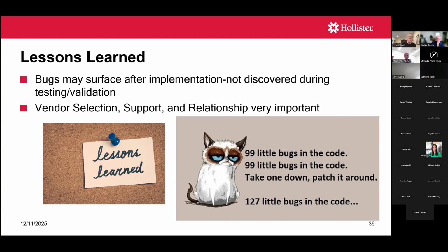In our particular case, Novatek was very responsive. They actually had to go and audit or really revise some of the source code for one of the functions, and then they do an impact assessment to determine what type of revalidation is going to be required for your system. So just keep that in mind.